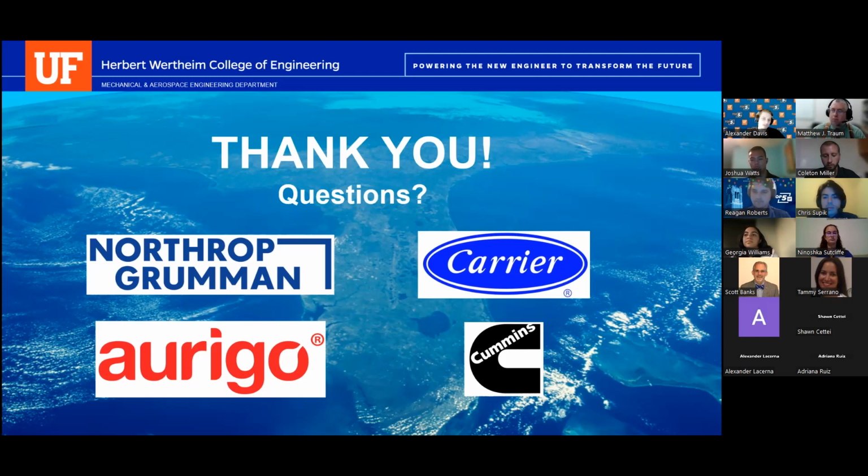Sure, if we were to go into the improvement of this design, I think personally a lot of us were also at the beginning of the semester leaning towards one of the designs with the vertical NEMA motors and the hub design, where the well plate was actually attached to those hubs, similar to the independent study that was shown to us at the beginning of the semester. Sure, that's more or less what I was looking for.